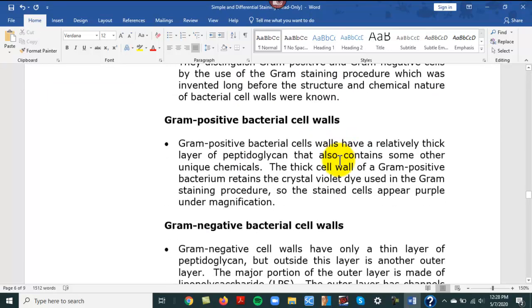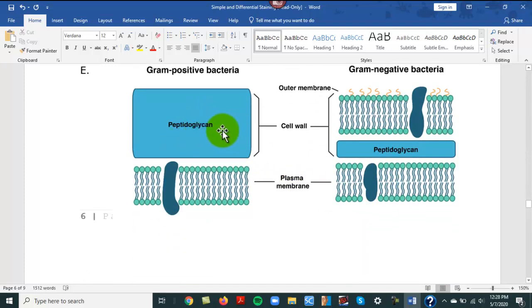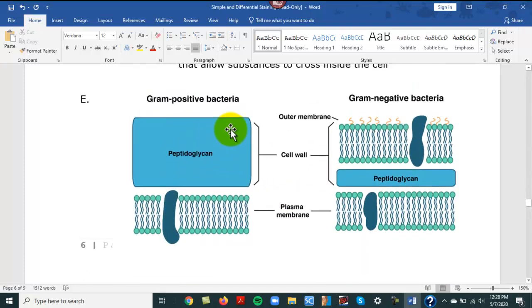Yeah, it has to do with the cell wall, gram positives, gram negatives. See, here's that thick layer of peptidoglycan. It is not disrupted by the acetone step. And here's the outer membrane. I like this one better. It's a little simpler. But see, the cell wall's got the two layers. That layer is destroyed. This layer is thinned out. And then during a gram staining procedure, the decolorizing, this is decolorized, so that's why it accepts the counter stain. That's why they stain red and why these stain purple.